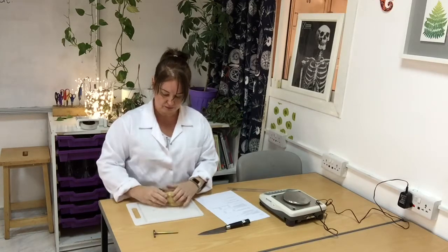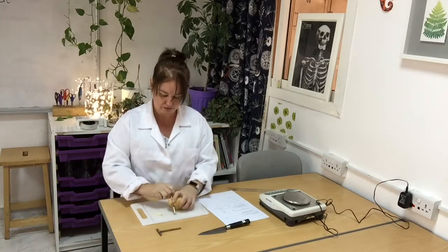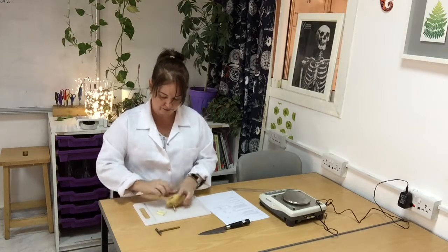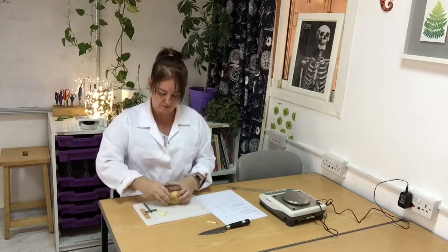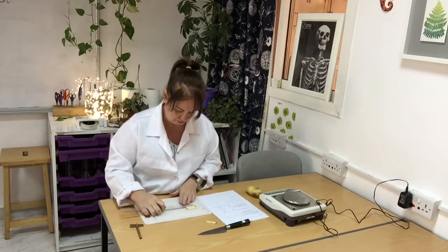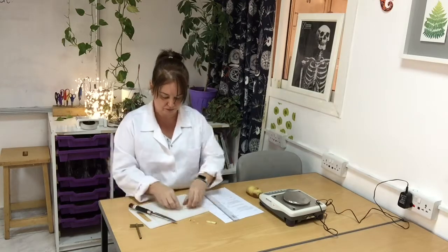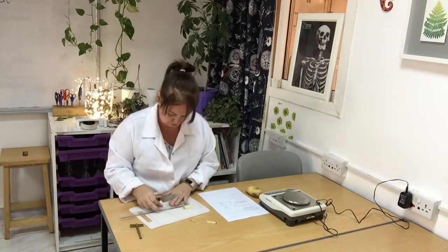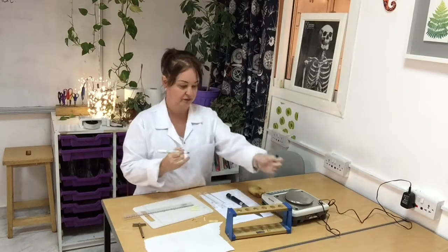I'm going to take 3 identical cylindrical tubes at about 3 centimetres or 30 millimetres long. Then I will weigh their mass and I'll measure their length. Then what I'll do is I'll put them in a 1 molar concentration of salt solution, leave them for 20 minutes, and then I'll re-weigh them and re-measure their length. So here I am, just ensuring that my potato tubes are aligned, and I'm cutting them to 3 centimetres, but of course afterwards I'll individually measure each one to make sure that it's correct.